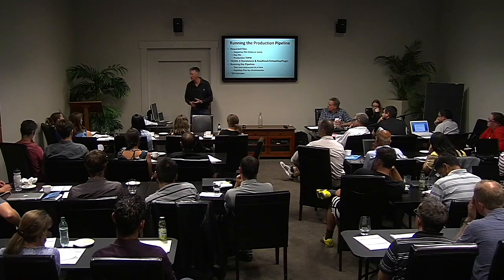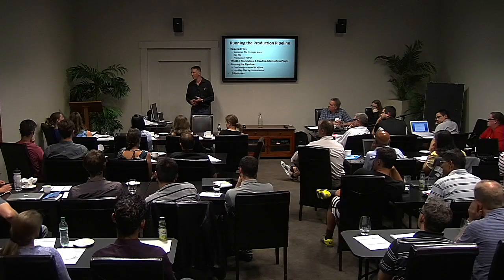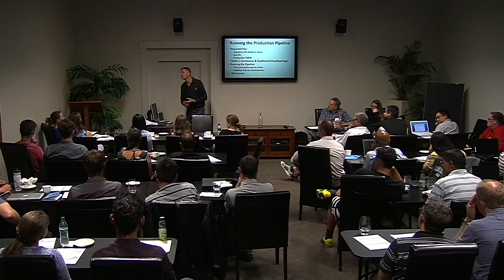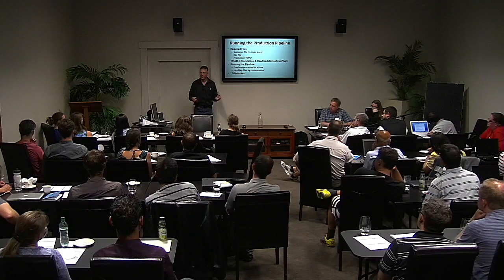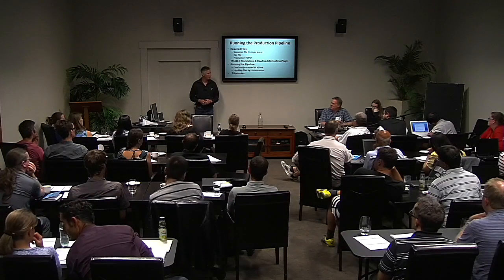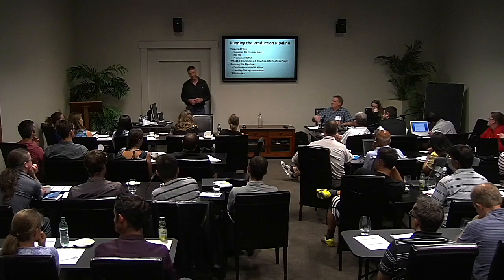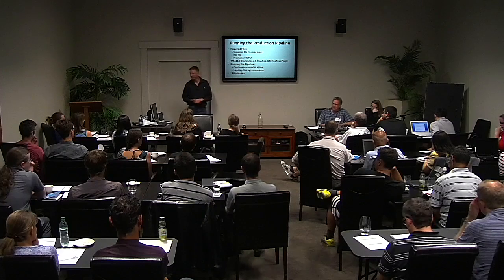Does that make sense? Yeah, because I guess some people would actually be stuck in the discovery phase forever? Well, I don't know. Could be, and it depends. Again, it depends, like Jeff's saying. If it's genomic selection where you're crunching a lot of agricultural samples through, I think as long as the founders of your breeding population are reasonably well represented, their diversity is reasonably well represented in the discoveries you've done so far, then probably you wouldn't need to run it again. But when you're bringing in new diversity that's not represented, you need to run a new discovery build.